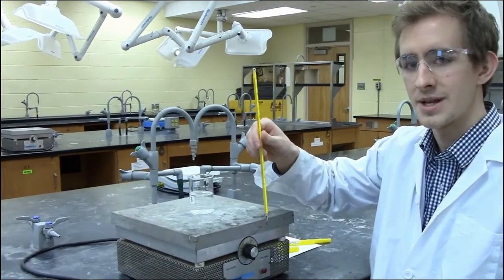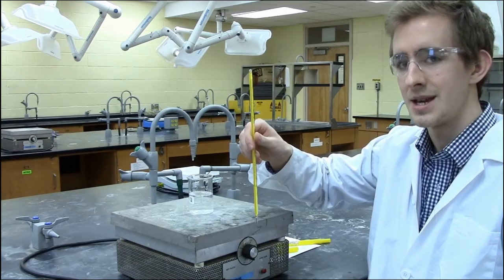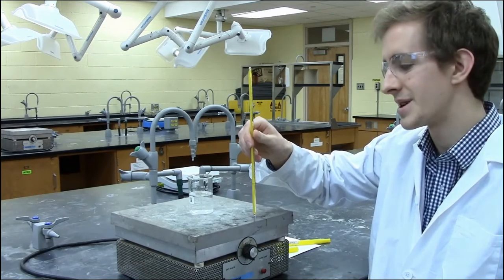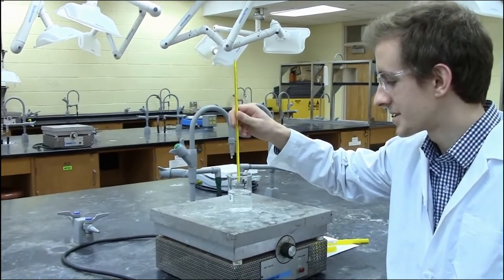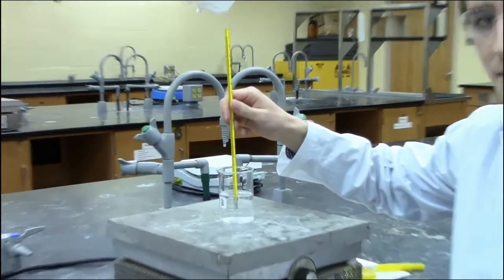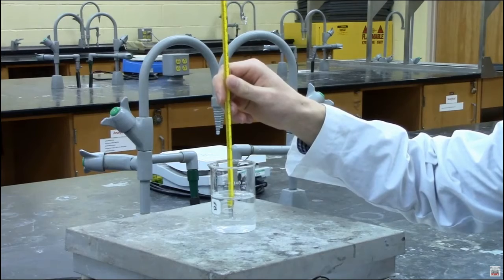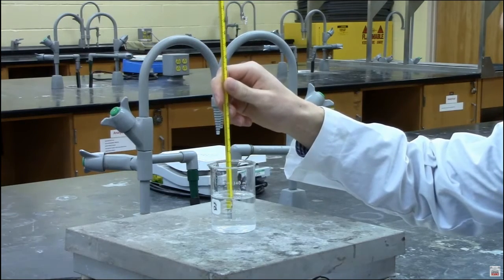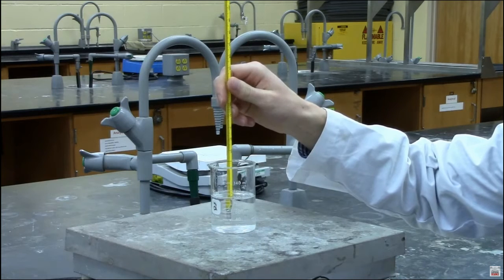When using the thermometer, avoid exceeding its range — do not go over 110 degrees Celsius or under negative 20 degrees Celsius. Make sure the thermometer is actually within your liquid and not touching the bottom of your beaker. In the case that it's on a hot plate, the hot plate and the base of the beaker will be much hotter than the solution itself, which could pose the risk of exceeding the reading limit of the thermometer.